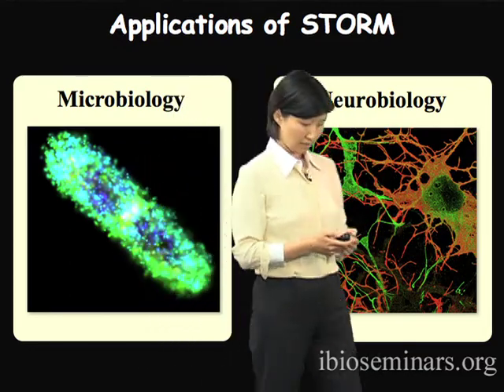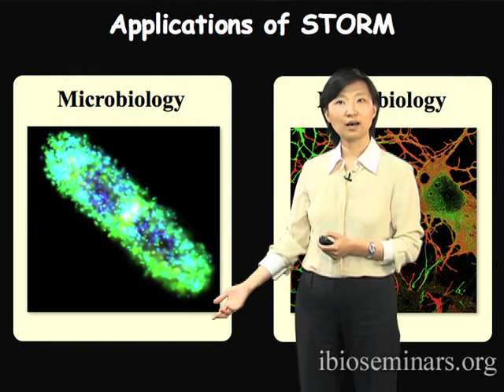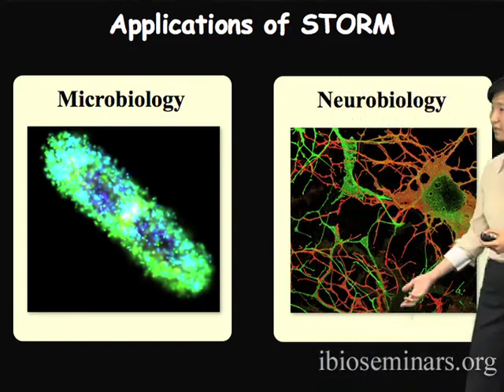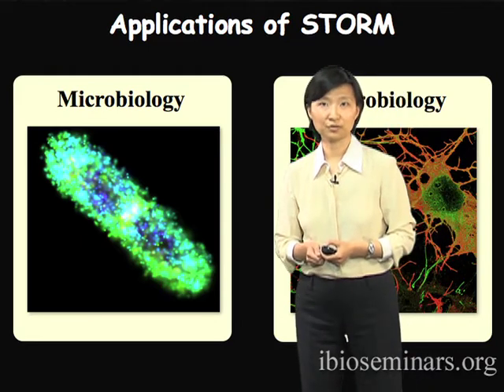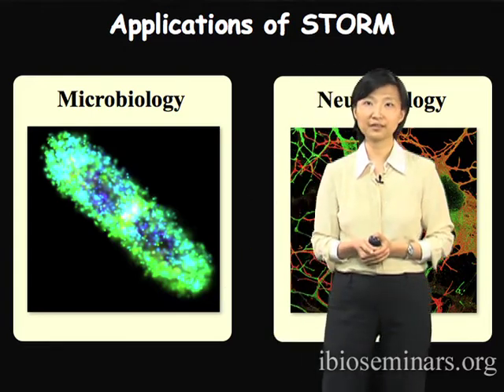neurobiology. So I will upfront say that in this application, we use photo-switchable fluorescent proteins to do the STORM imaging. And in this application, we use photo-switchable dyes to perform STORM imaging. So first, our application in microbiology.